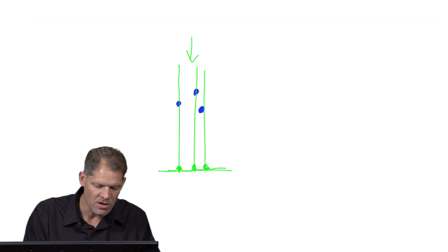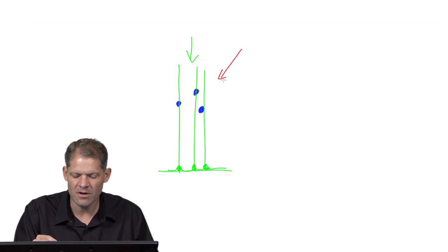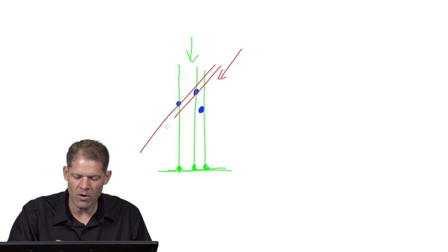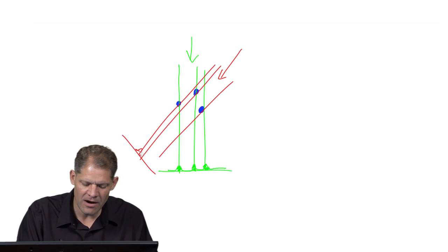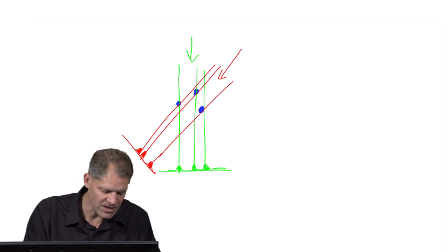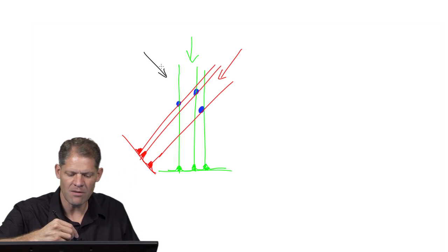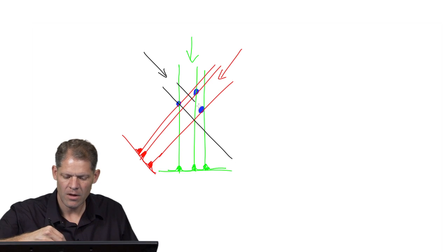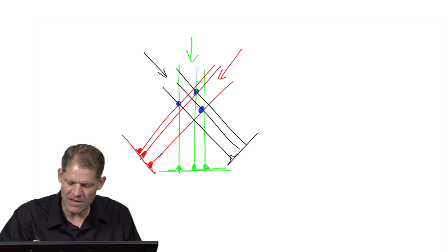Now let's suppose that we record another projection image in this direction. Okay, now what we'll see on a detector is a density there, and then a density over here where this projection would come to. Now finally, let's imagine that we recorded yet another image from this direction. And so we got this projection image with the density there, and there, and there.